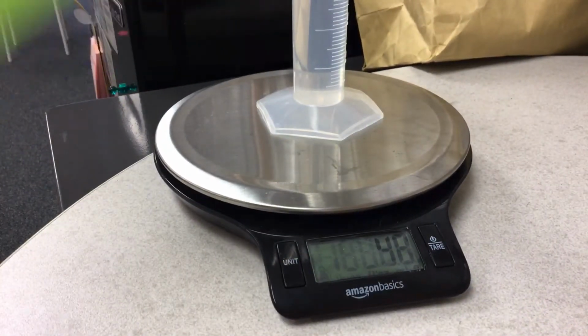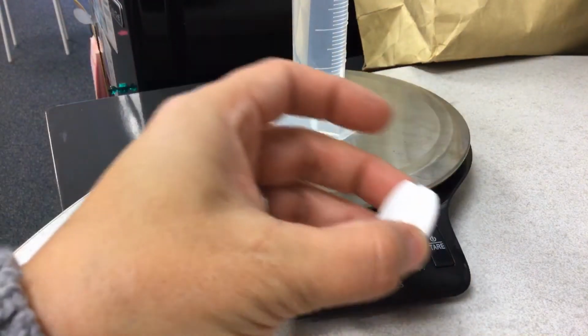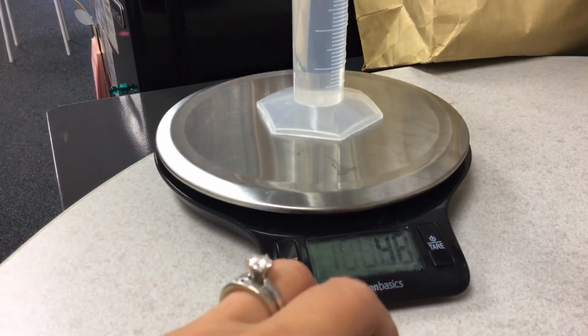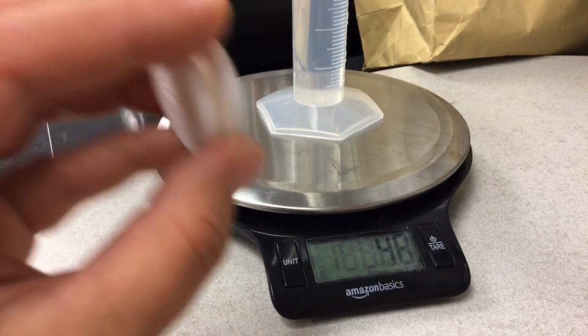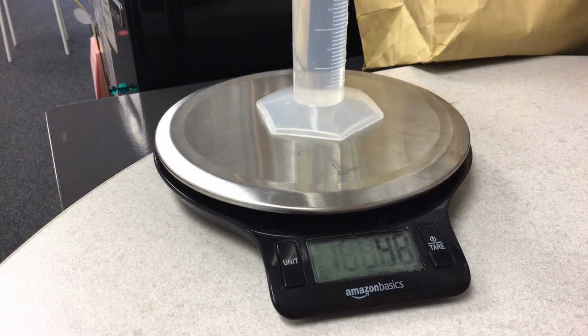So what we're going to do is we're going to watch to see what happens when I put the Alka-Seltzer tabs in, which I know you guys already know it's going to fizz and bubble and everything else. It is going to release a gas that is called carbon dioxide, and we're going to see what happens to the weight. So remember, 54 grams is what my total weight of my tabs and the water is, and we're going to take a look and see what happens.